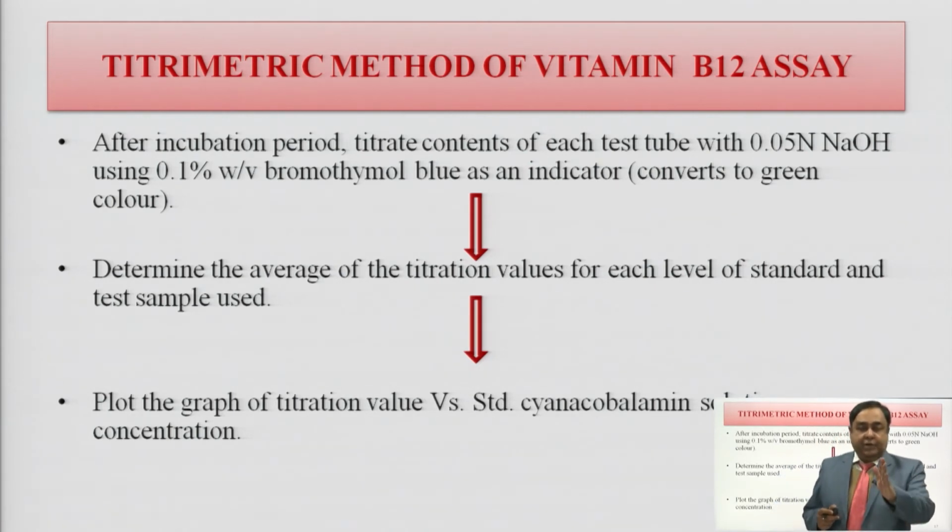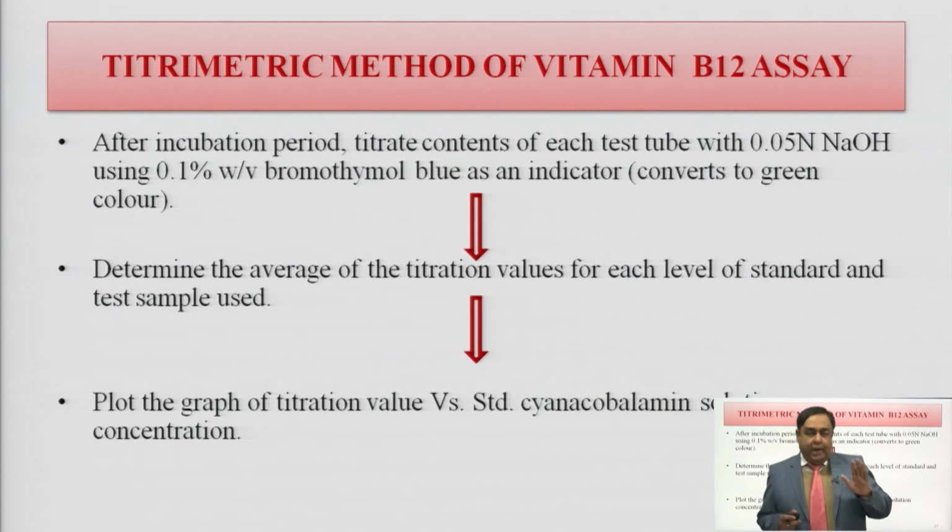I am repeating once again. Whenever you add the basal media and the standard solutions, the organism will try to grow because of the presence of vitamin B12 during the process of incubation.